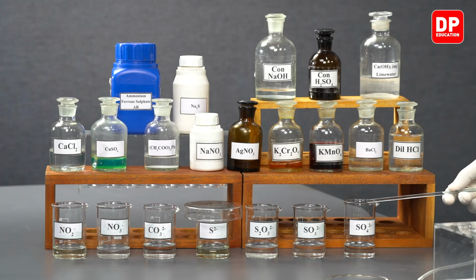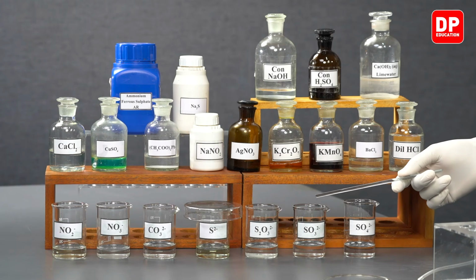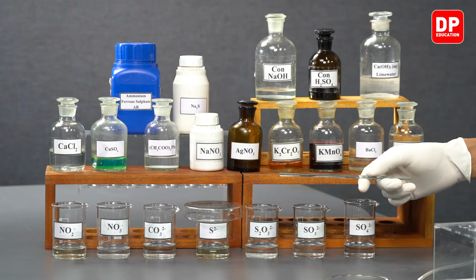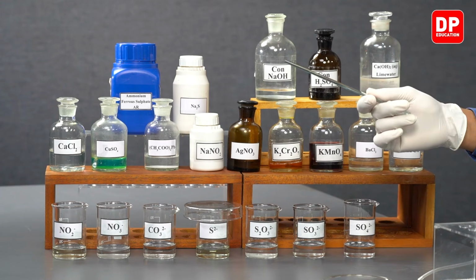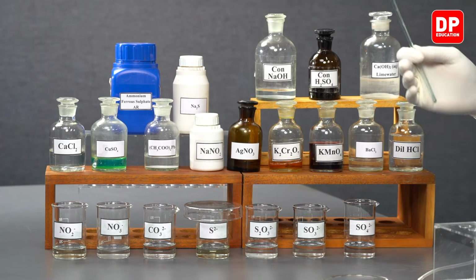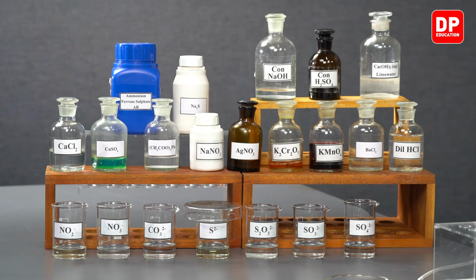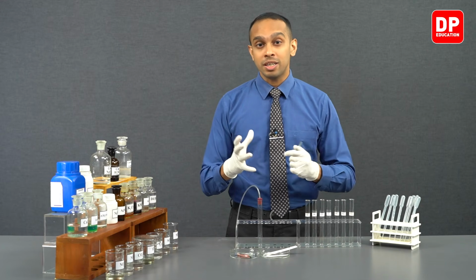We'll be using sulfate ion solutions, sulfite ion solutions, thiosulfate ion solutions, sulfide ion solutions. The sulfide ions were formed by dissolving sodium sulfide in water, and we have covered it so that the hydrogen sulfide that may be produced will not come into the lab atmosphere, because hydrogen sulfide, as you may know, has a very pungent smell.